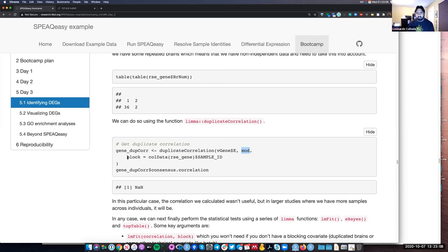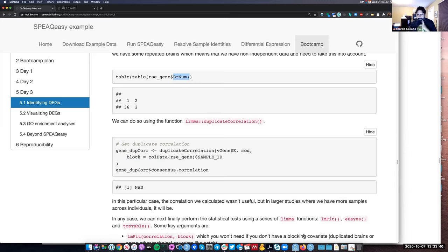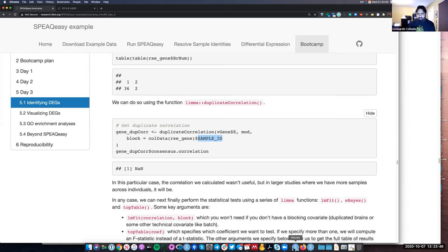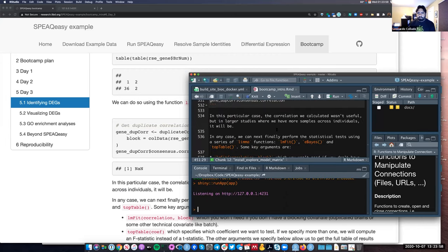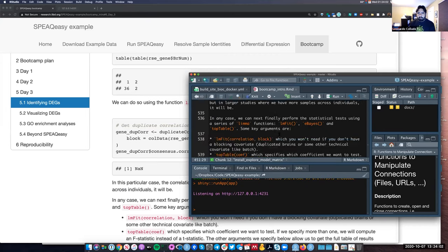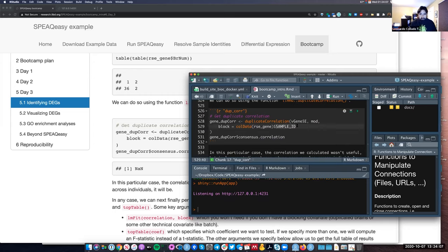The block argument has to be a factor or character with one element per sample in the dataset. Actually the code here has a mistake — it was blocking by sample ID, but it should actually be the BRNUM. That's probably why it didn't work. The duplicate correlation function takes a little bit of time to run. What it does is estimate the correlation across the samples inside each of the blocks. I made a mistake earlier blocking through a variable that is completely unique — that's why I got a result that was not a number.